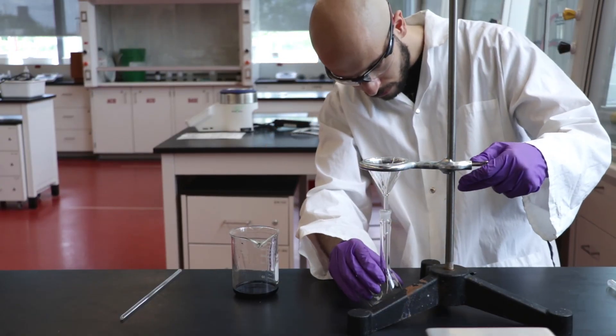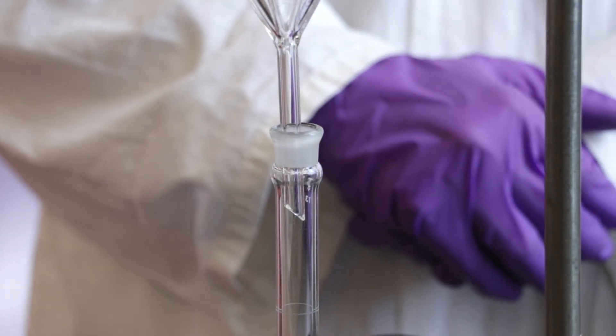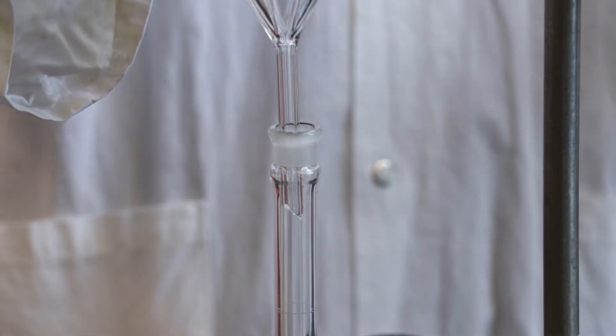Adjust the position of the ring clamp so that the funnel tip rests inside the volumetric flask approximately 2 to 3 centimeters.